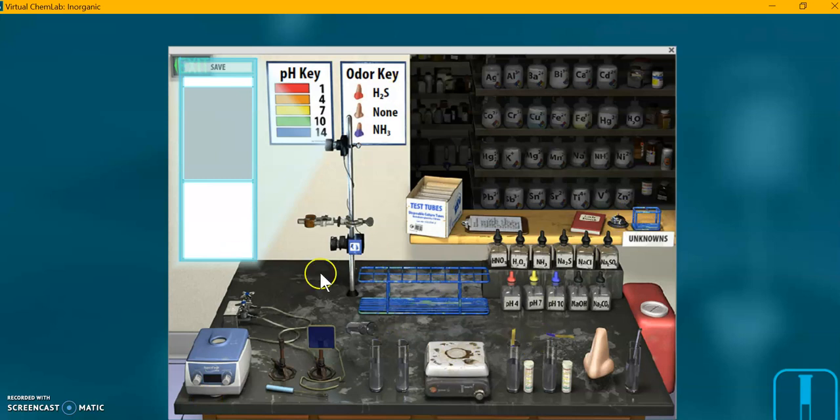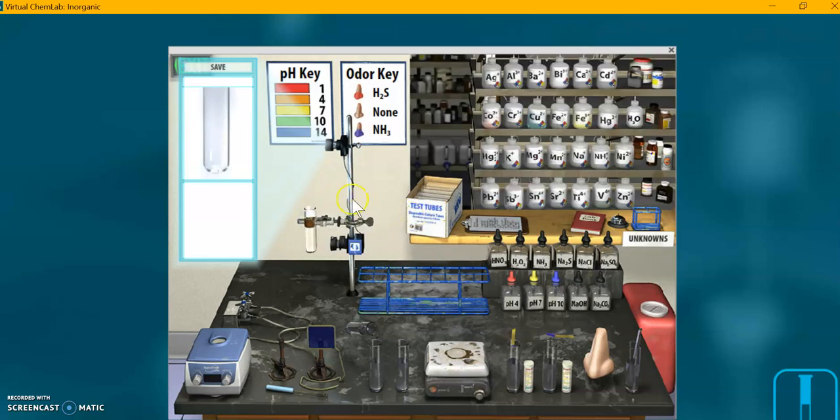As you can see everything is all set up for us again. Now I'm going to grab a test tube and bring it over here to the test tube stand. This is what they call the metal test tube stand, your test tube rack.